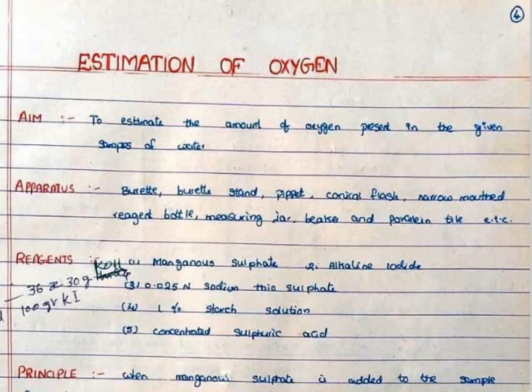Oxygen. Aim: to estimate the amount of oxygen present in the given sample of water.